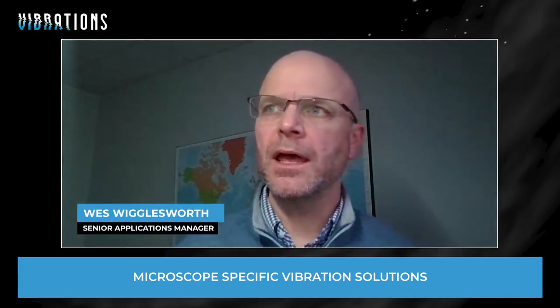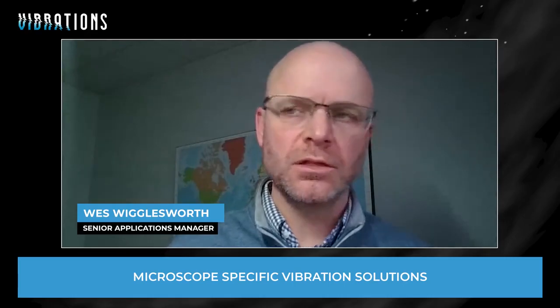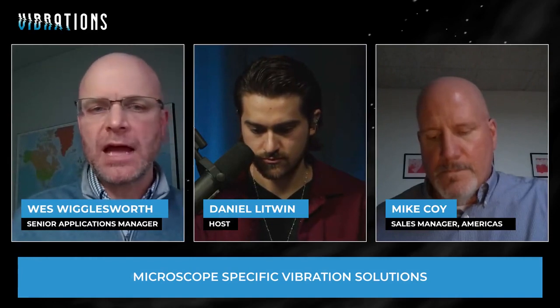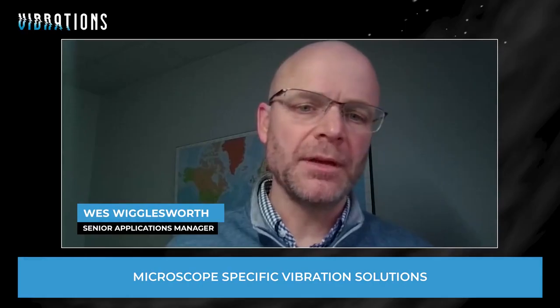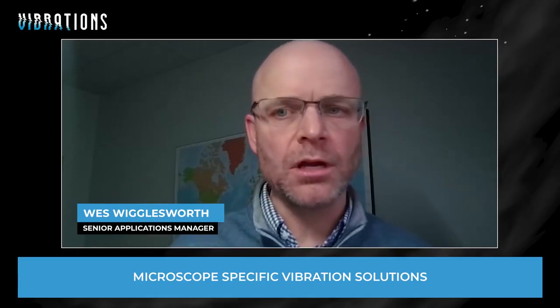Sure. And in answering that, I'd like to focus on the vibration isolation solutions that address the two different things, internal and external. An SEM has vibration in itself. Any frame, any structure is naturally vibrating at some frequency, and SEMs and TEMs therefore have isolators built into them. So the electron beam column inside the microscope is supported by its own internal, either pneumatic or steel springs or rubber springs. So they're very good at isolating at high frequencies.